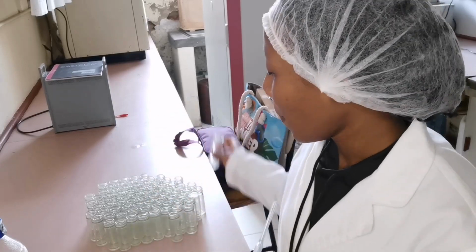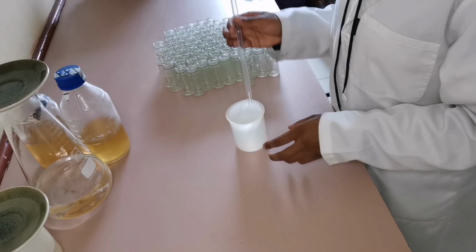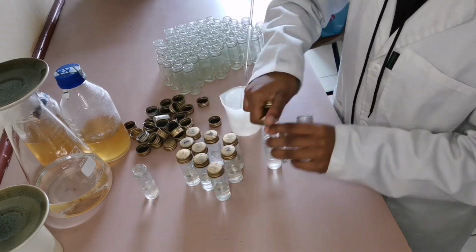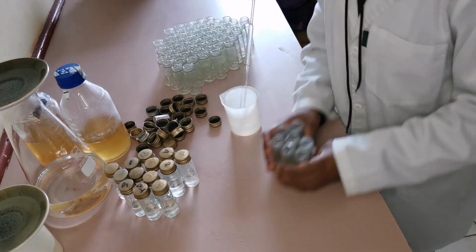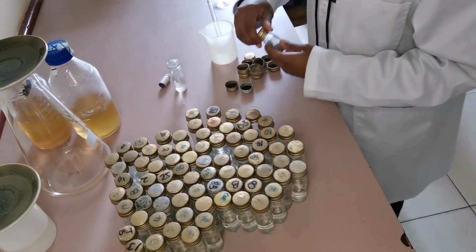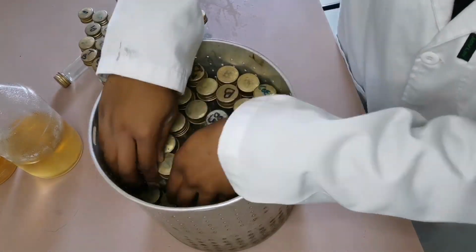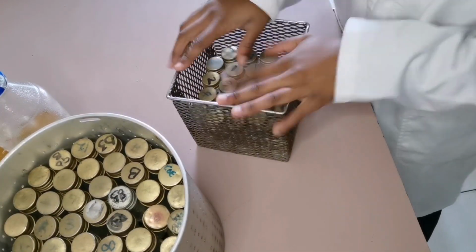I'm sure you've seen me doing this before. But anyways, let's move together. This is the mark for 9 milliliters, by the way. Currently done filling the vials.